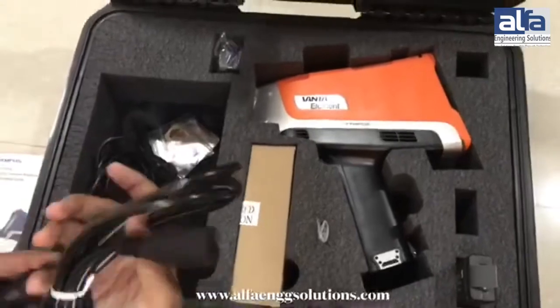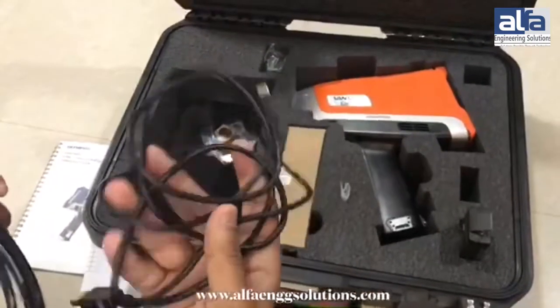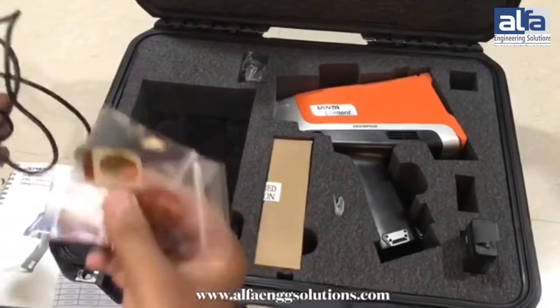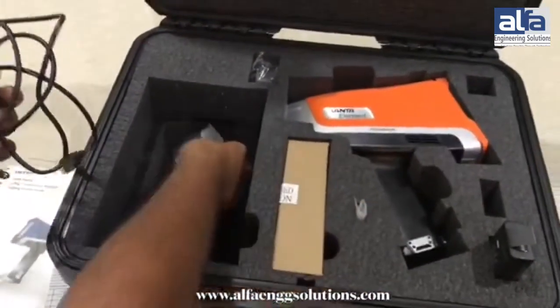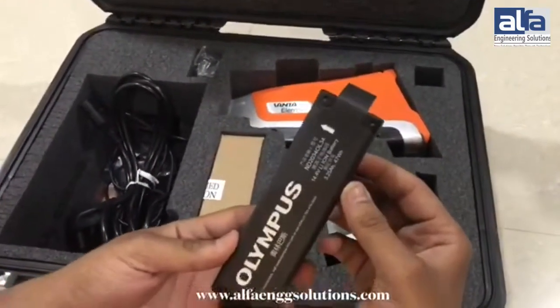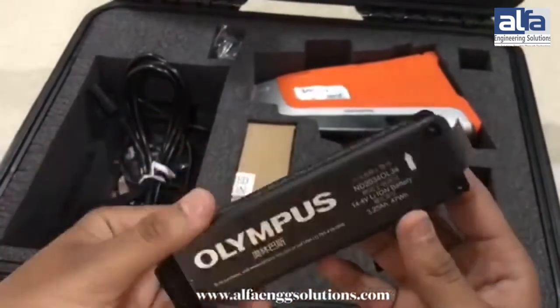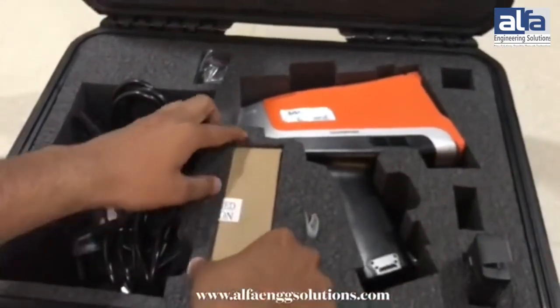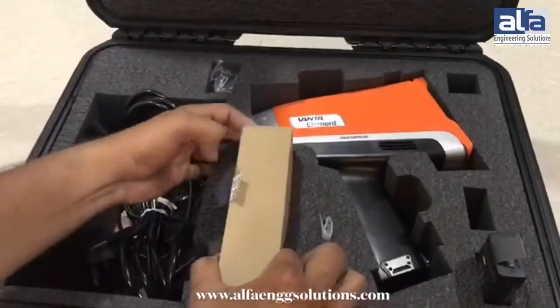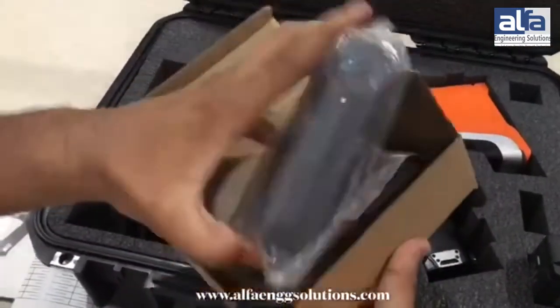This is the power cable, which is used to attach with the charging adapter. This is the data transferring cable. This is the fluorescence film. This is the lithium ion battery. This is the power adapter, which is used to charge this device.